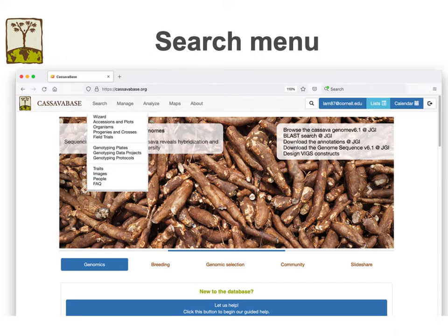Here is a brief overview of the user interface. Every page contains a menu bar with the same menus. The first menu is the Search menu, which gives access to all the different searches. It searches for accessions, trials, genotyping information, traits, and more.